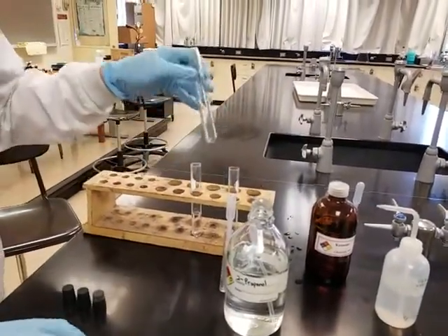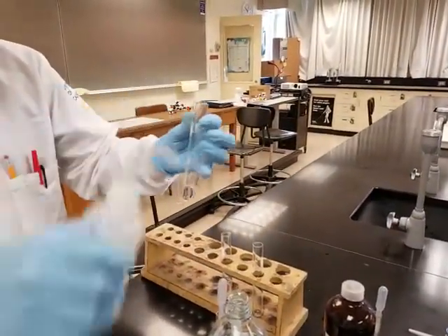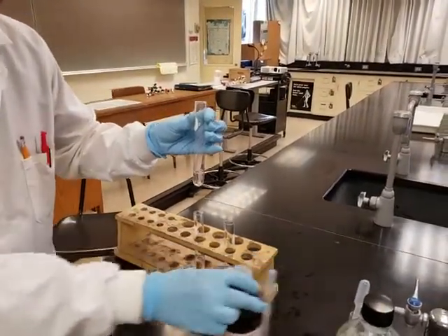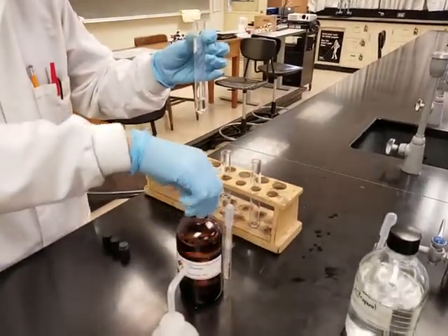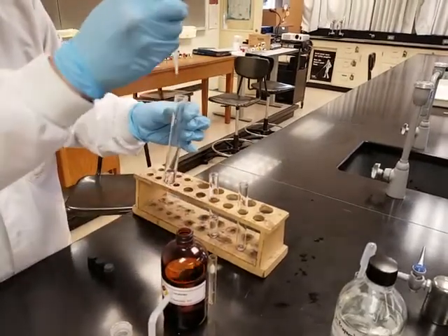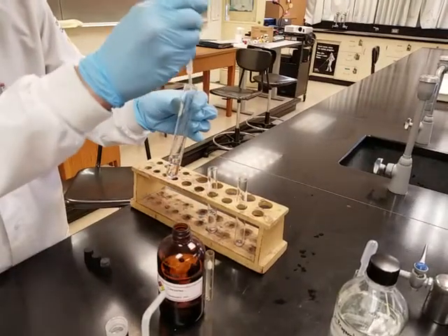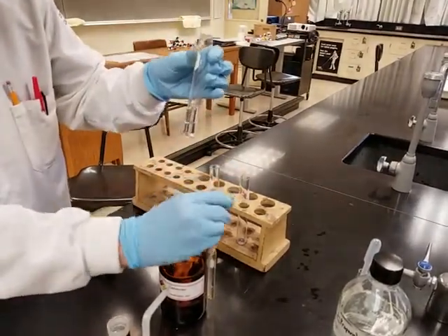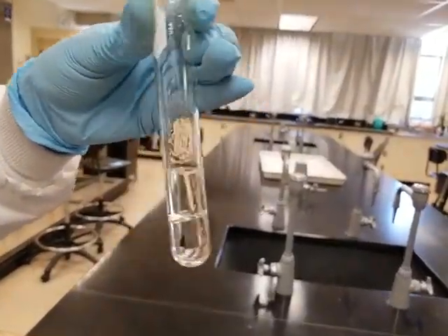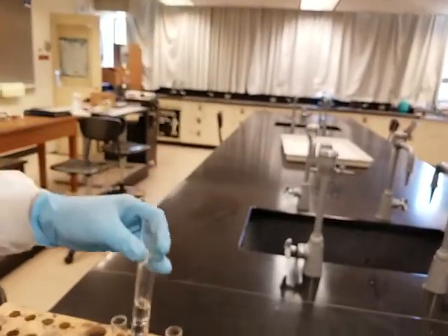Second test tube, we're going to have DI water and kerosene. Let's put the same amount of DI water in. There's some DI water. And instead of isopropyl alcohol, we're going to put in some kerosene. Here's some kerosene. Kerosene is highly flammable. We're going to put roughly the same amount of kerosene inside. It's like water. I haven't shaken it yet, but take a look at what it looks like. Can you see it? Interface, yes or no? Mix together, yes or no? We're going to mix it in a bit.